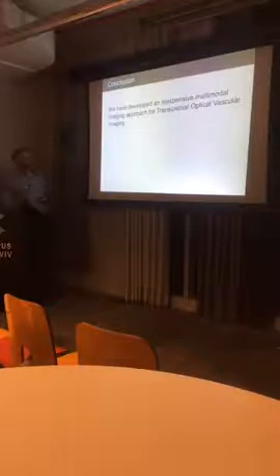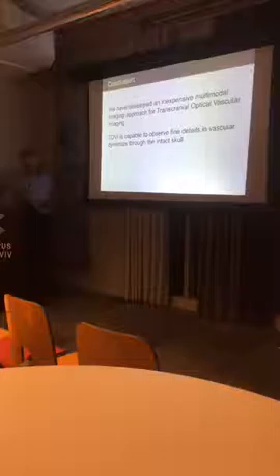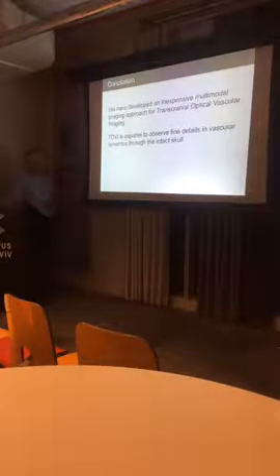I would say, as a conclusion, that this method is first of all informative, can give functional information, and of course it is absolutely inexpensive. Certainly our next plan is to do 3D imaging, and I will show some results, how it looks, as a video.